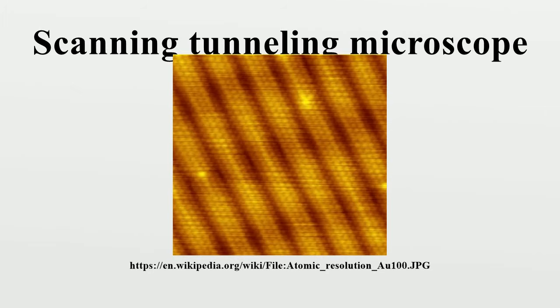The resulting tunneling current is a function of tip position, applied voltage, and the local density of states of the sample. Information is acquired by monitoring the current as the tip's position scans across the surface, and is usually displayed in image form. STM can be a challenging technique, as it requires extremely clean and stable surfaces, sharp tips, excellent vibration control, and sophisticated electronics, but nonetheless many hobbyists have built their own.